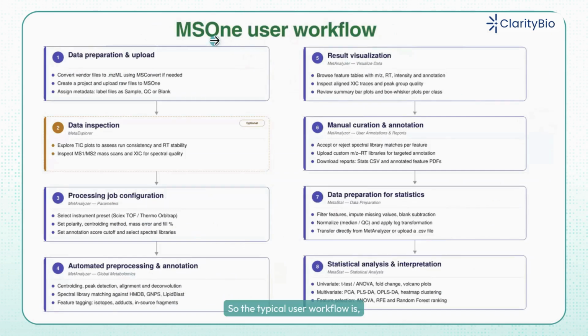The typical user workflow starts with mzML files. You would convert your raw data into mzML format and upload that. So you create a project and upload files to the project. Then you would inspect the data using Meta Explorer. As I said, this is an optional step.